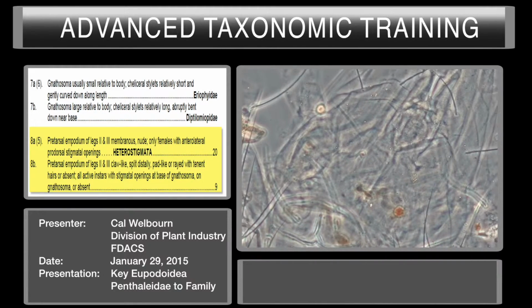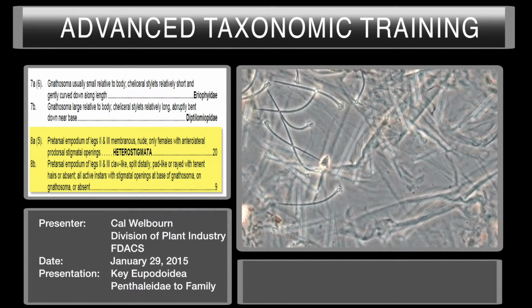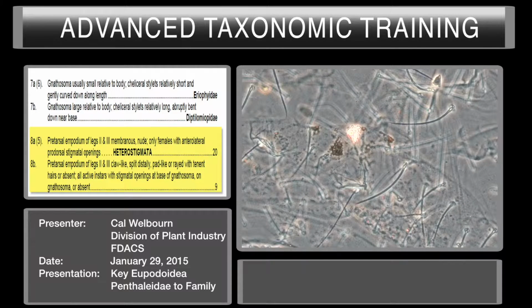And as I recall, we could not say for sure that there were prodorsal trichobothria. All right, we'll do it, and we'll look at it. This is 40x. We'll look at it right now, and then we'll go back to oil so you can actually see it in detail. But because this particular mite is hypertrichous, it's hard to find trichobothria in the cuticle you're looking for.